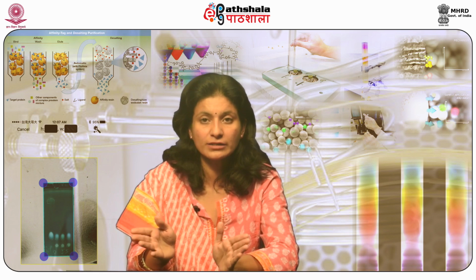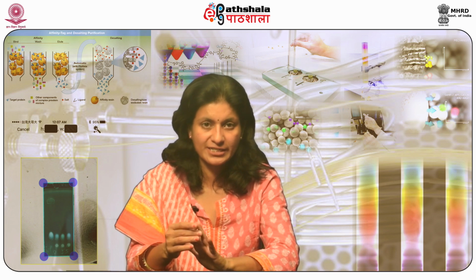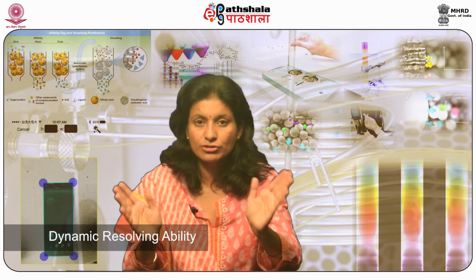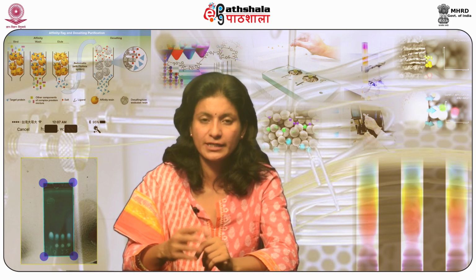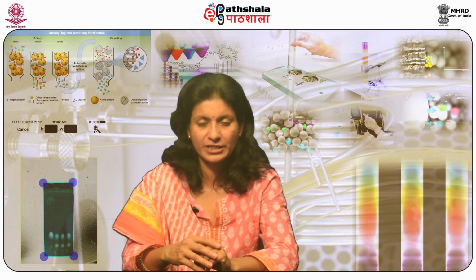Ion exchange chromatography has become one of the chief chromatography approaches as compared to other liquid chromatography approaches because of average cost, huge sample handling capability, easy automation as well as scale-up, dynamic resolving ability, extensive applicability in addition with high throughput application scheme. It can be used at all the phases and proportions of purification.